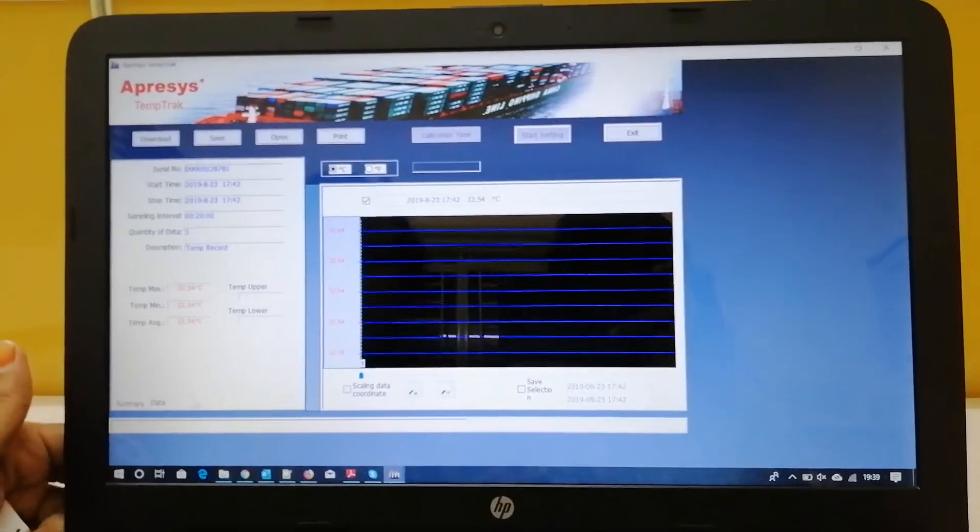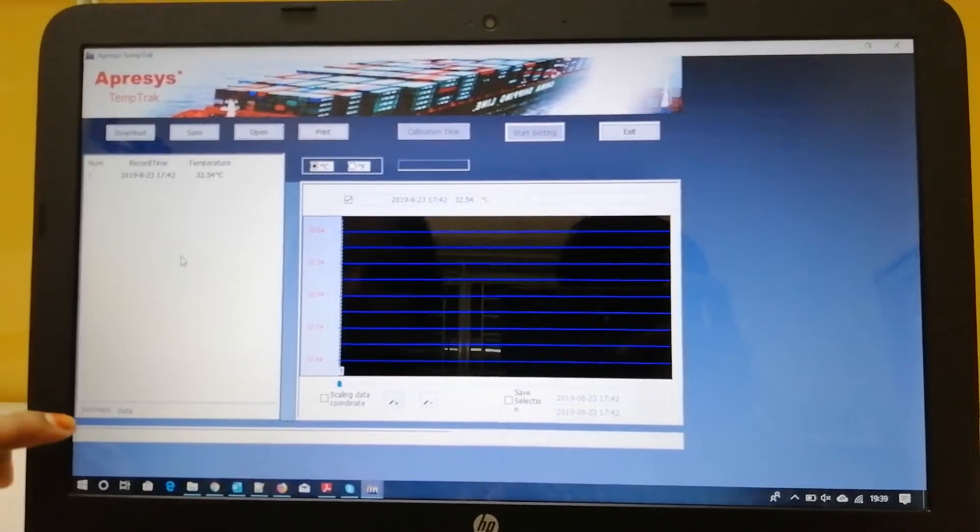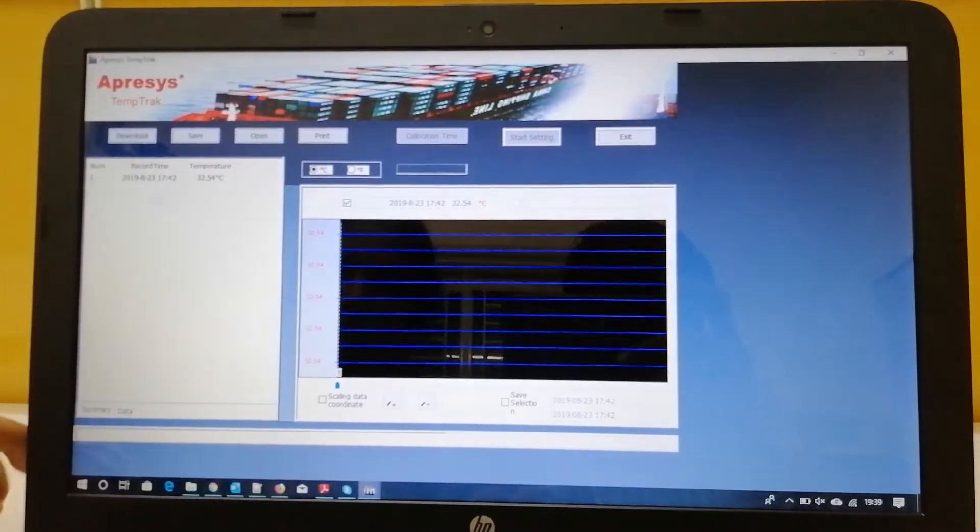Here in the data section, you can see all the recorded data with the recording time.